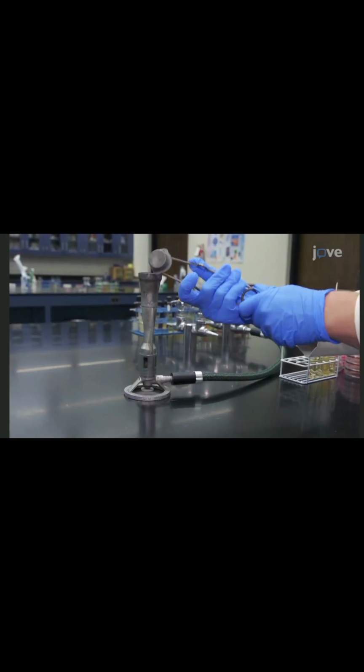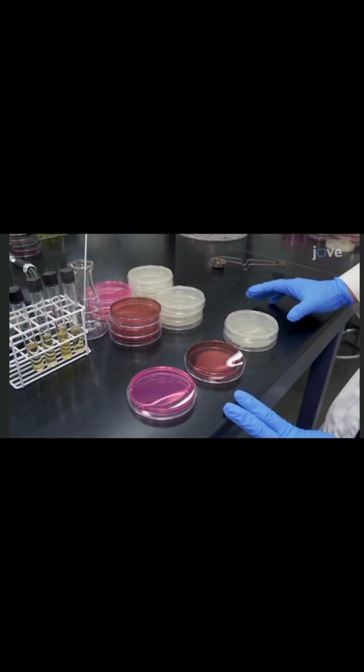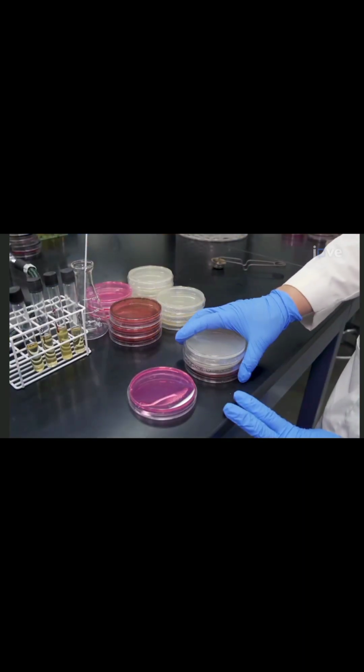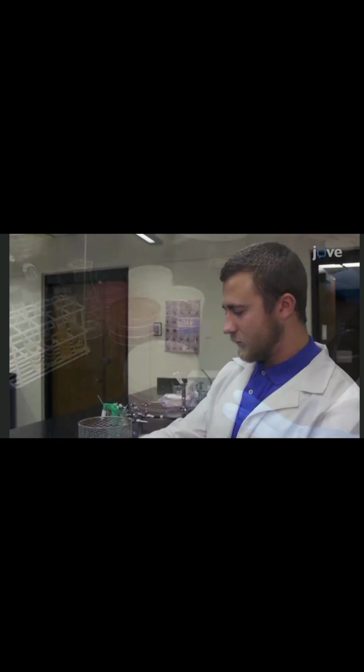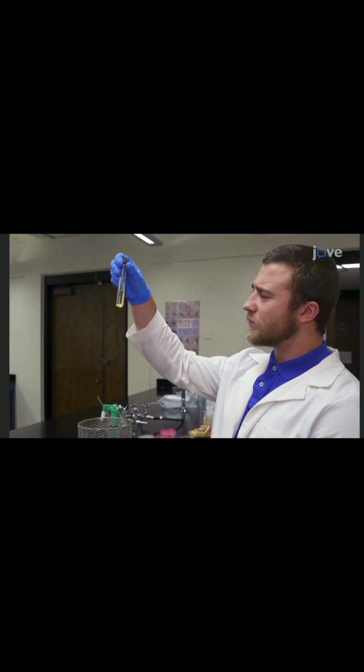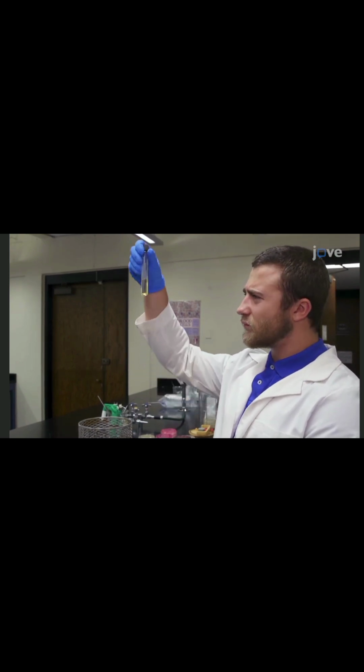To begin, light a Bunsen burner which will be used to sterilize the tools. Then place 1 MSA plate, 1 EMB plate, and 2 TSA plates close at hand. Then select one of the bacterial cultures. You will inoculate all 4 of these plates with the first culture.